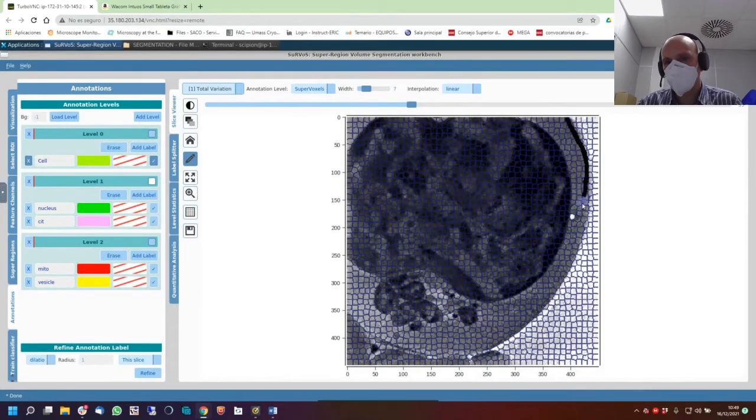You will see, it doesn't matter. It will try to select the boundary because you are selecting this. Click. You see? Go click. How accurate it is depends on the size of the supervoxels. See, and now it's much easier.